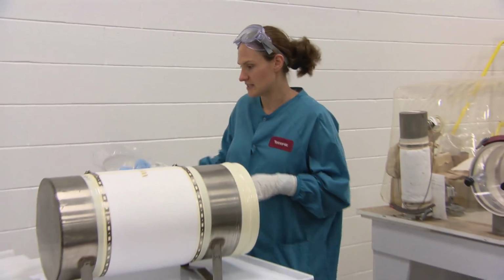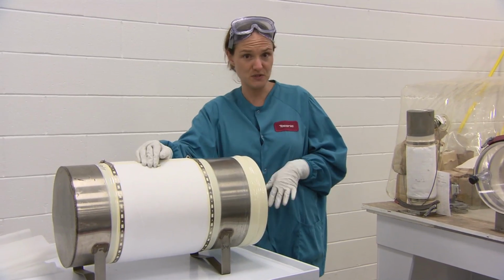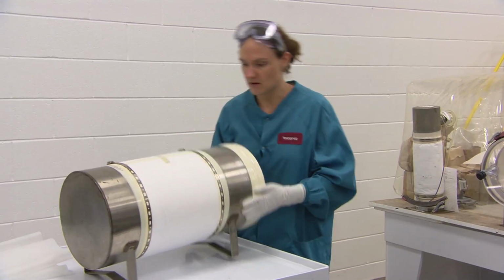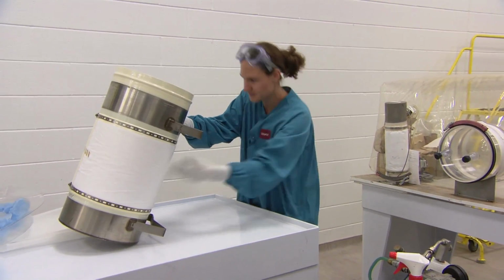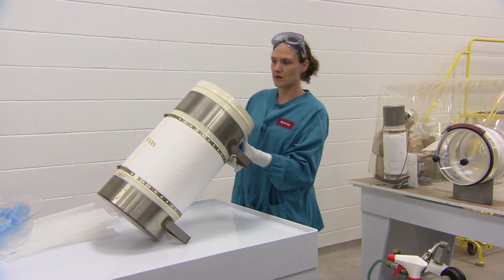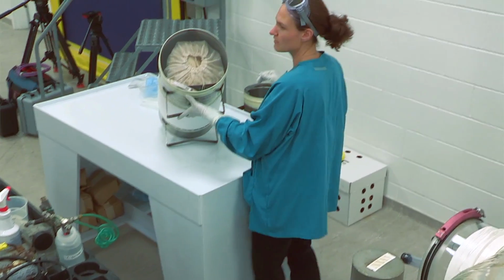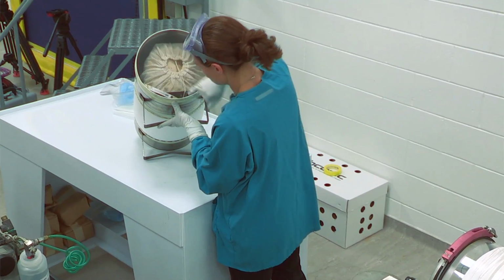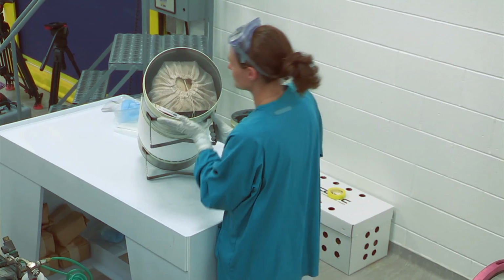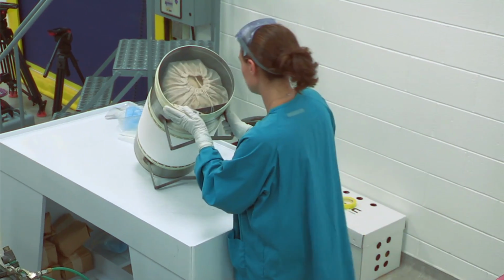Now we can take a look at our cylinder, and we want to look at this filter media and make sure that it does not have any tears or punctures. Just make sure that everything underneath is good. And then we want to look at our mylar here and make sure that we don't find any holes. A lot of times if you do find holes, it seems to be really close to the edge here. And sometimes just tilting it up towards the light, you can see a little bit better than if you just have it flat on the table in front of you.